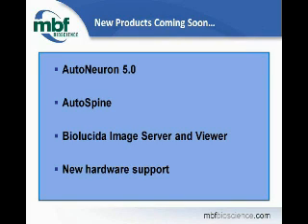We are always adding new hardware support, whether it be cameras, motorized stages, or different illumination devices. One of the things that I'm told it's a little too early to announce is Lucivid, but I know there are a number of Lucivid users out there, and while I'm not allowed to tell you that a new Lucivid is on the horizon, I will tell you that I saw a prototype of the Lucivid that was very, very promising. It's color, it's 4-color, or it's monochrome, and we're very excited about it. So keep an eye out if you're a Lucivid user.